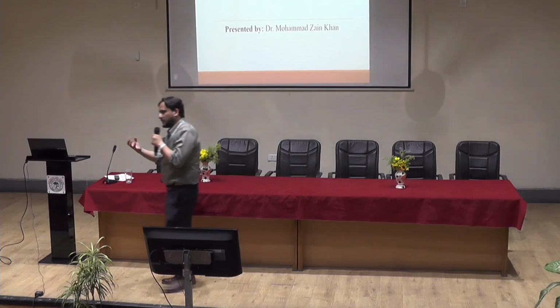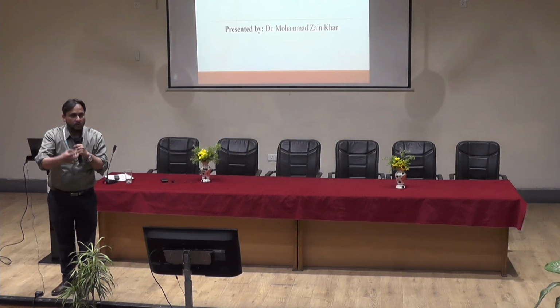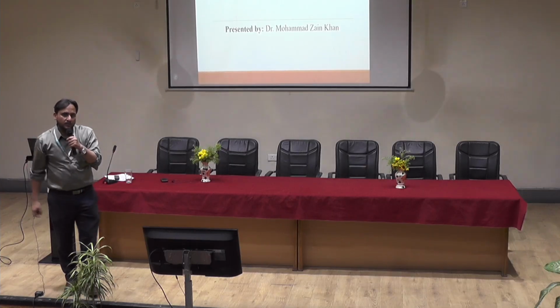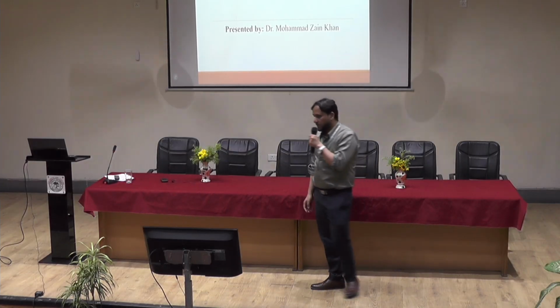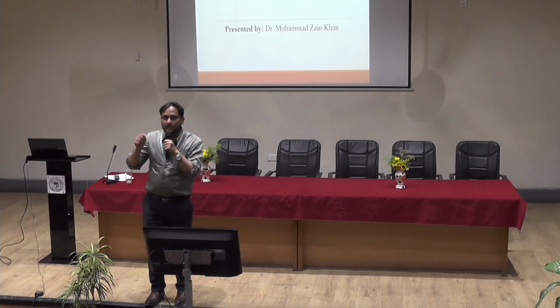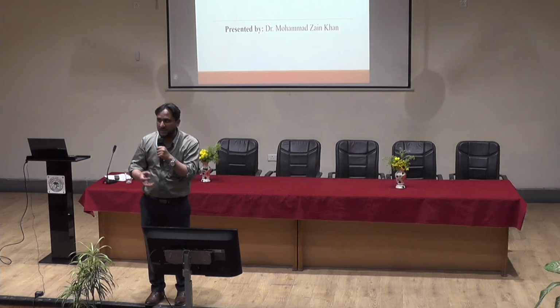Those sharp peaks reflect that the material is crystalline, and from those sharp peaks we can also calculate the size of the crystal as well, known as crystallite size. And since we are doing this workshop, this Gyan course on nanotechnology, for nanomaterials it is very important that once you prepare your material, you have to ensure and prove that they are in the nano range.